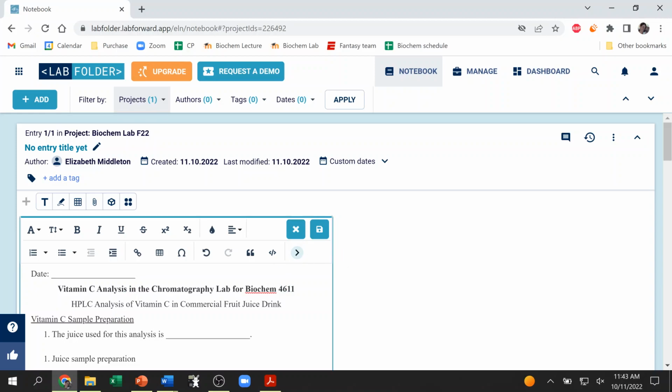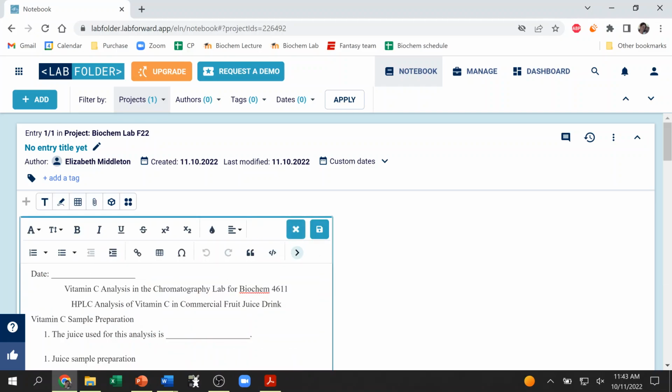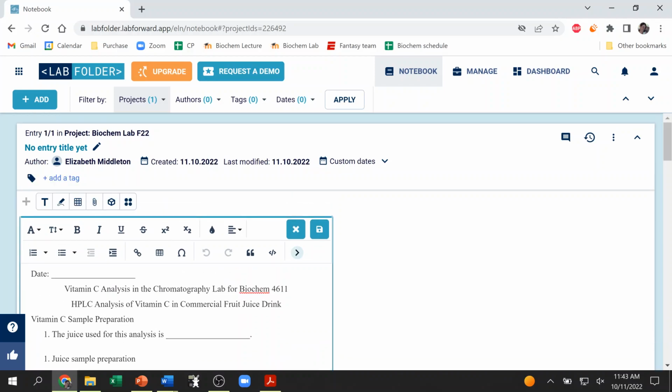All right, now it looks like it kept a lot of the formatting that we needed, and it did. What you're going to see though is if you save it, and then re-edit it, it actually loses a lot of that. I don't know why. But it still kept all the text and some of the formatting. Okay? So that's one option, is you can start with that and then go through and make any changes that you need to.